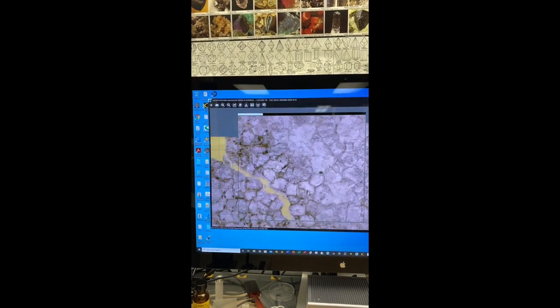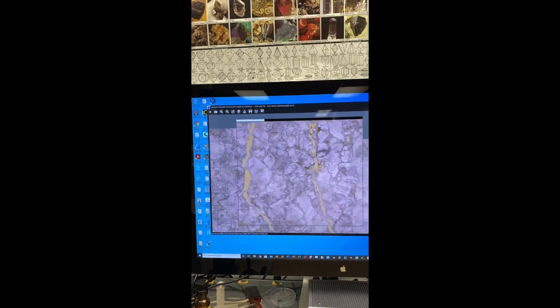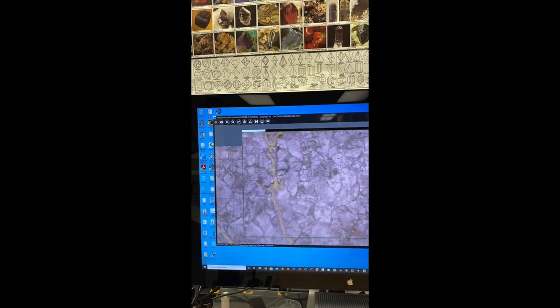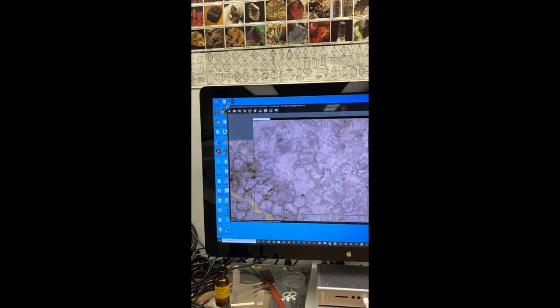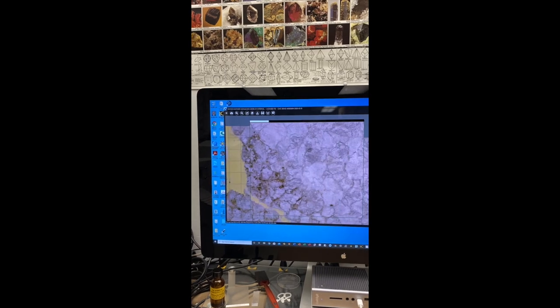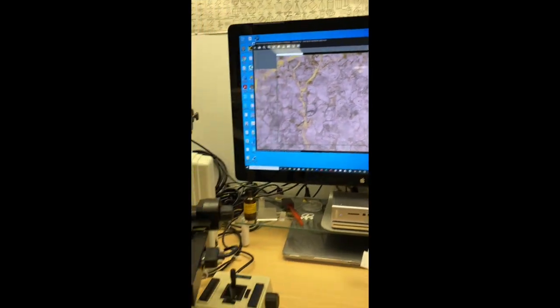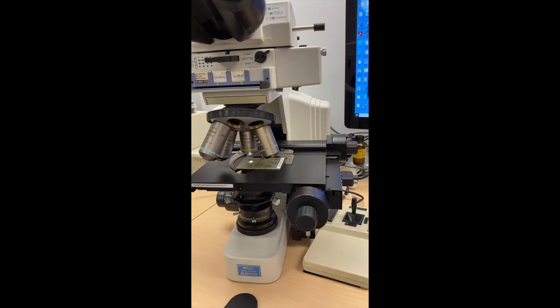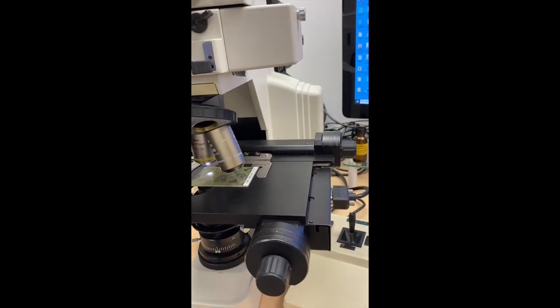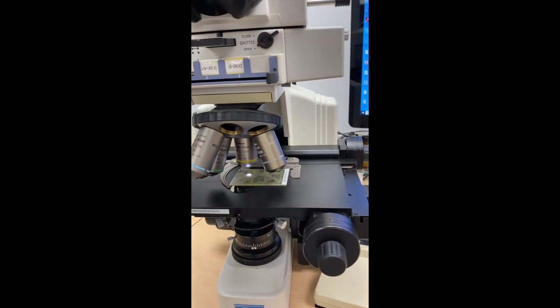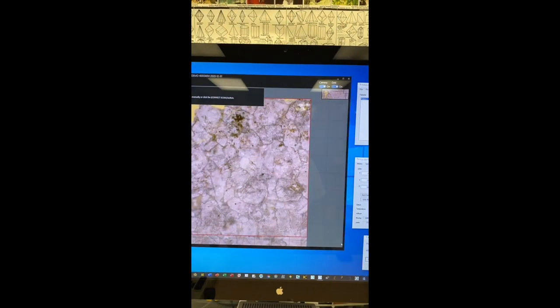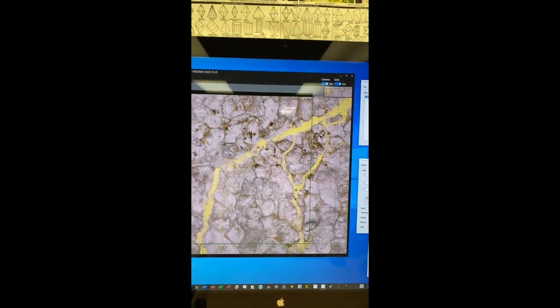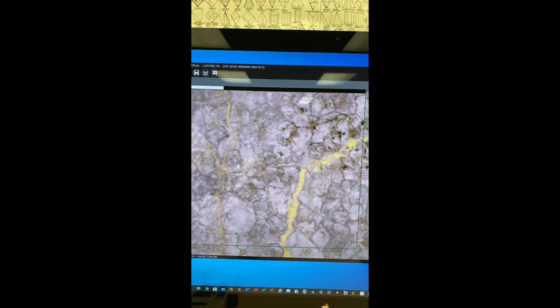To make an XY raster scan of the area you have selected... it's finished, so you can adjust the setting, especially the acceleration. I set it at 20, you can bring it down to 10 to go slow.